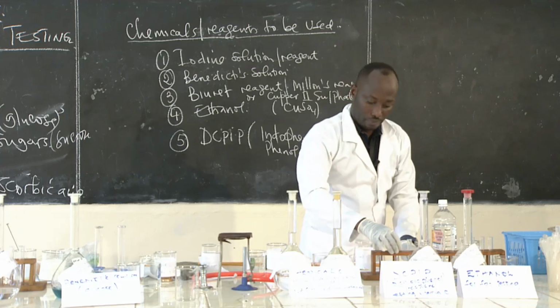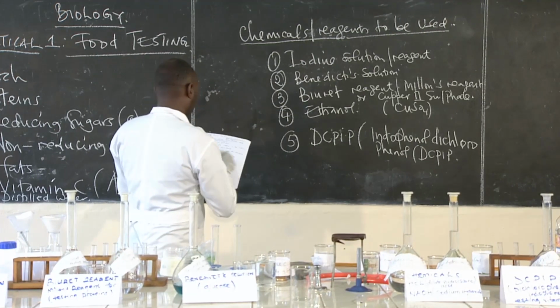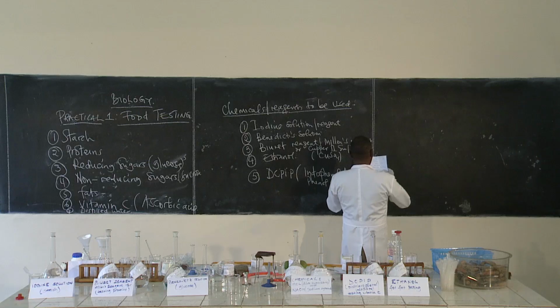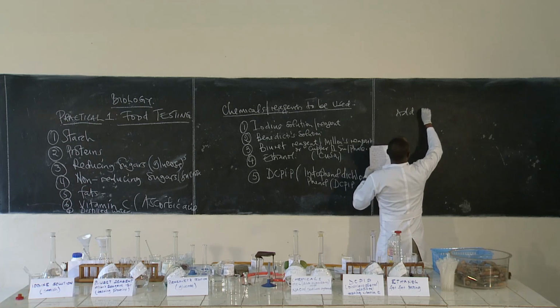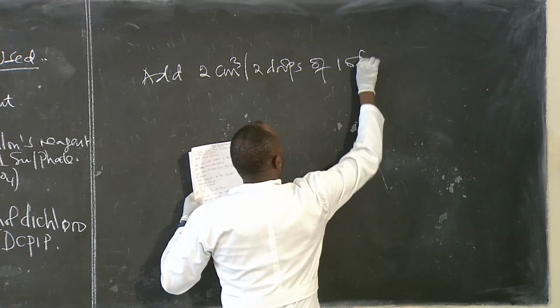Take a note of this. Write this one in your book. You can say, add iodine solution, 2 drops of iodine solution.